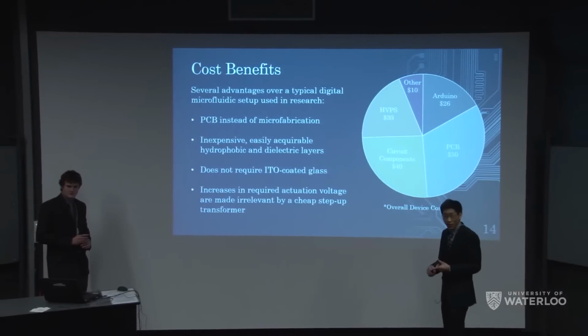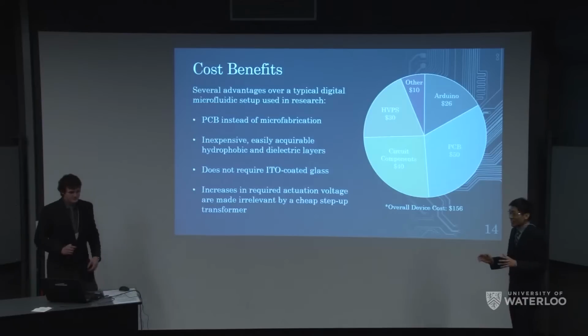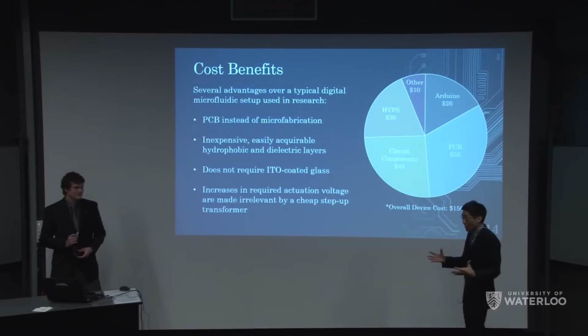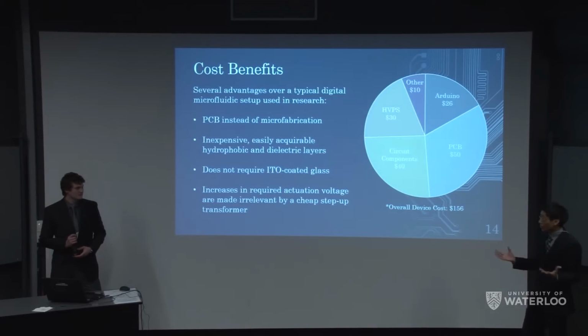If you're a researcher or a microfluidic enthusiast, you could just have a grocery list of the kind of equipment you need. Just a PCB schematic is something that we could provide you, along with the instructions for the rest of the digital microfluidic device.